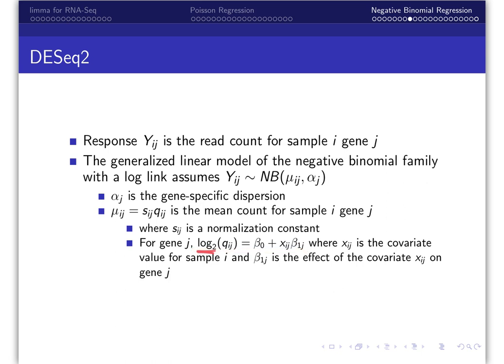predictors. In the DESeq2 package, the log base 2 link is used rather than the natural log to facilitate interpretation as a fold change. In fact, DESeq2 also uses empirical Bayes to shrink the log fold change estimates. The Wald test is based on the shrunken log fold changes and their standard errors for testing differential expression as the default inference method for extracting p-values. Thereafter, genes are typically identified using a suitable false discovery rate threshold.